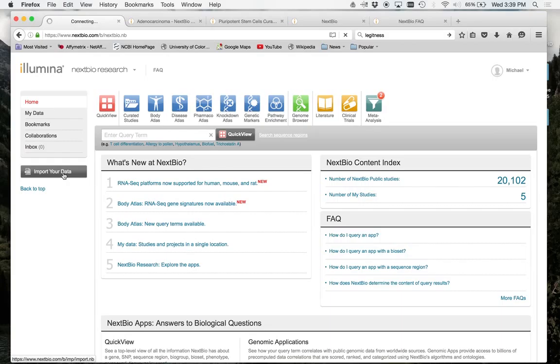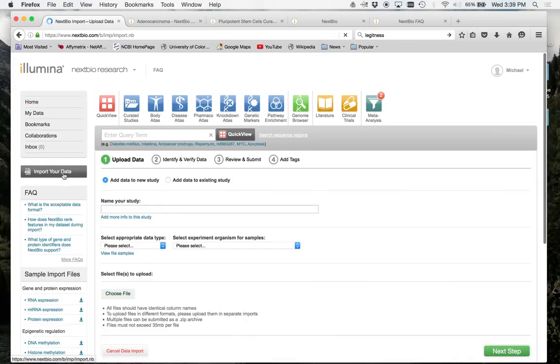So what I'm going to do is download the data set that we analyzed at the very beginning. Remember the stem cell data set? Our big question was, we did a two-way ANOVA. We found out what was different between all the genes that changed due to differentiation state and were different between pluripotent versus the embryonic stem cells, ES cells. Okay, I have that list saved somewhere. I'm just going to go stem cells.